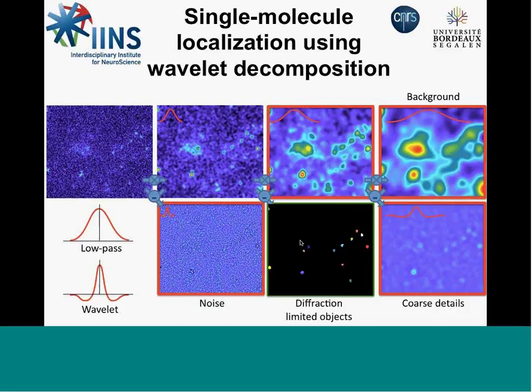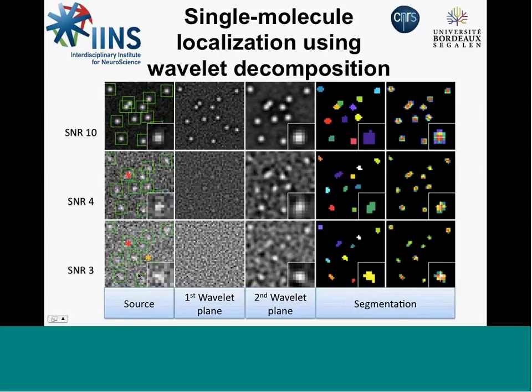Once you develop a new technique, you have to check its performance, so its accuracy and its capability to resolve molecules in more or less dense or noisy situations. So we performed simulations, did the decomposition, and saw how we can retrieve information even at very low signal to noise, simulating that with single molecules with a low number of photons.